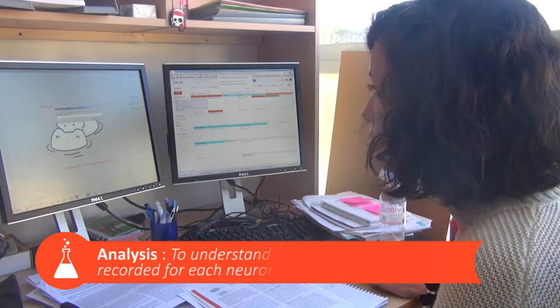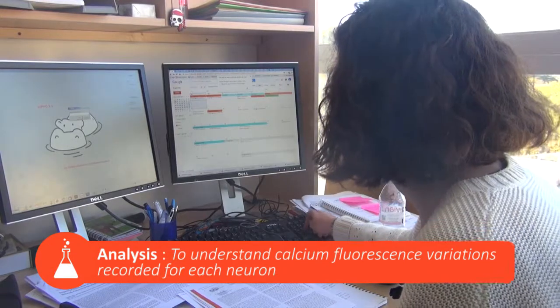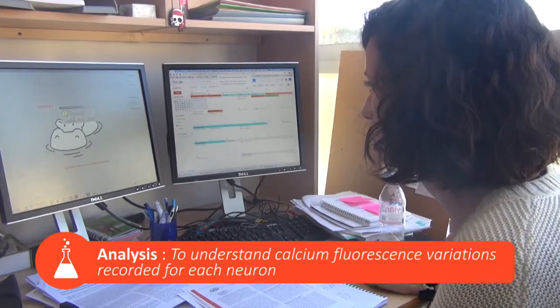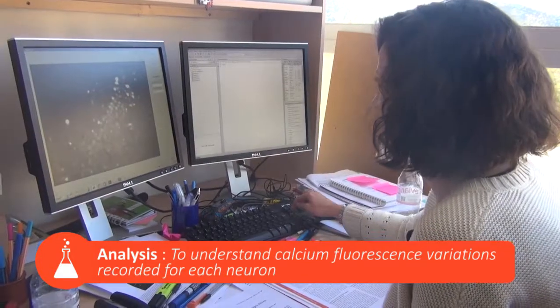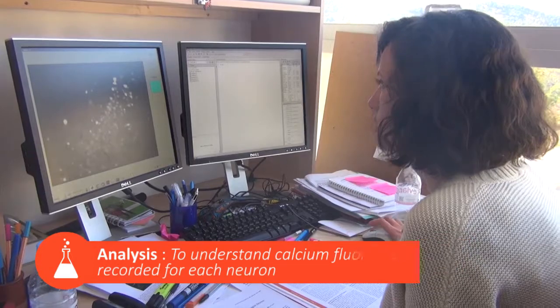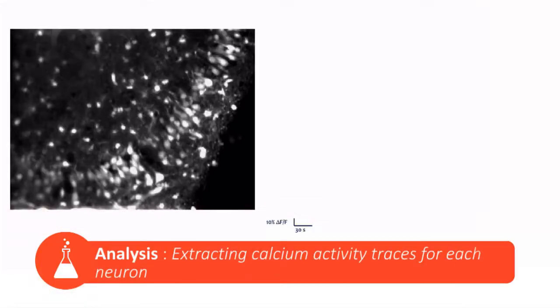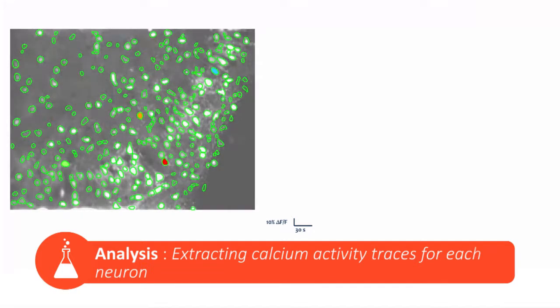Now we are going to see how these calcium image recordings can be analyzed. For instance, an analysis of this data helps highlight synchronous neuronal activity. We used a program that was developed and refined in the lab. To analyze our calcium image automatically, we input into the program the acquisition parameters of each of these recordings, such as the temporal resolution, i.e., the time spanned by each image in the series.